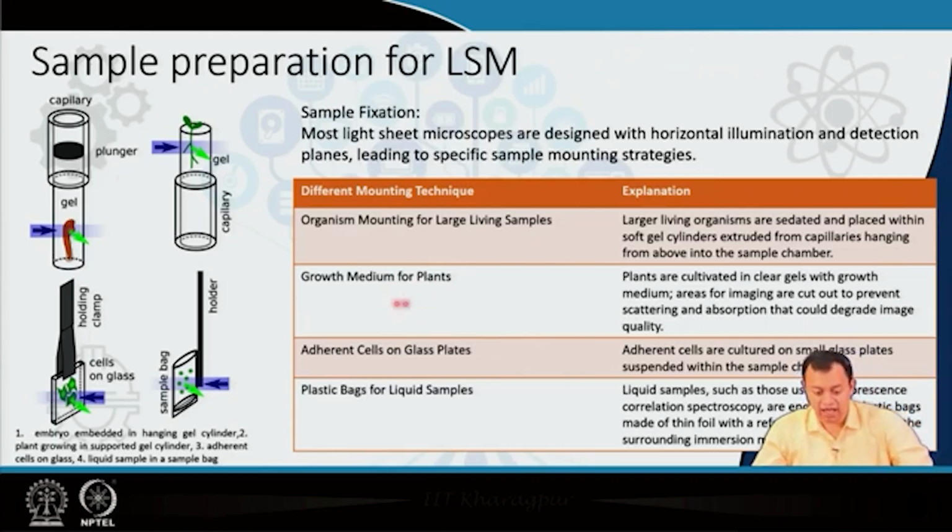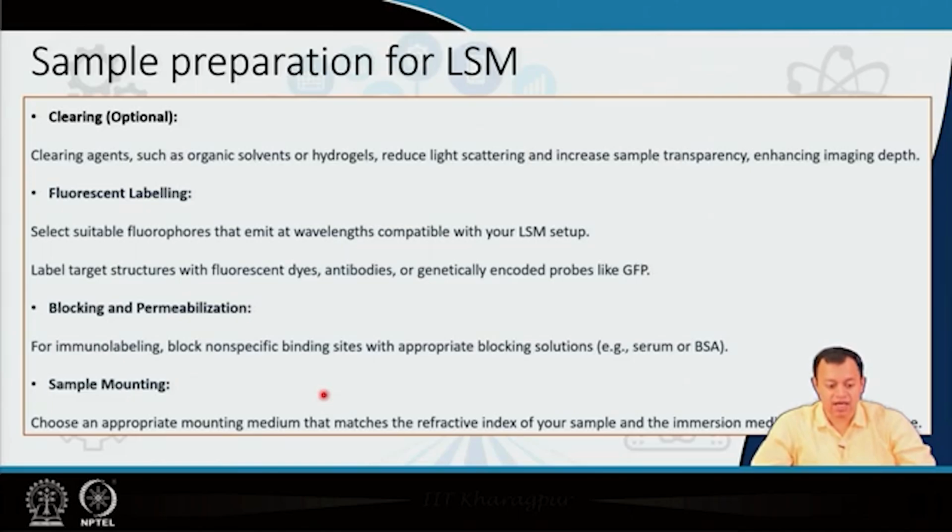So, you can have the growth medium of plants, you can have cell glass plates, you can have plastic bags for liquid samples, you can have organism mounting like these kinds of clamps holding the sample. So, all of those things can be utilized using LSM.